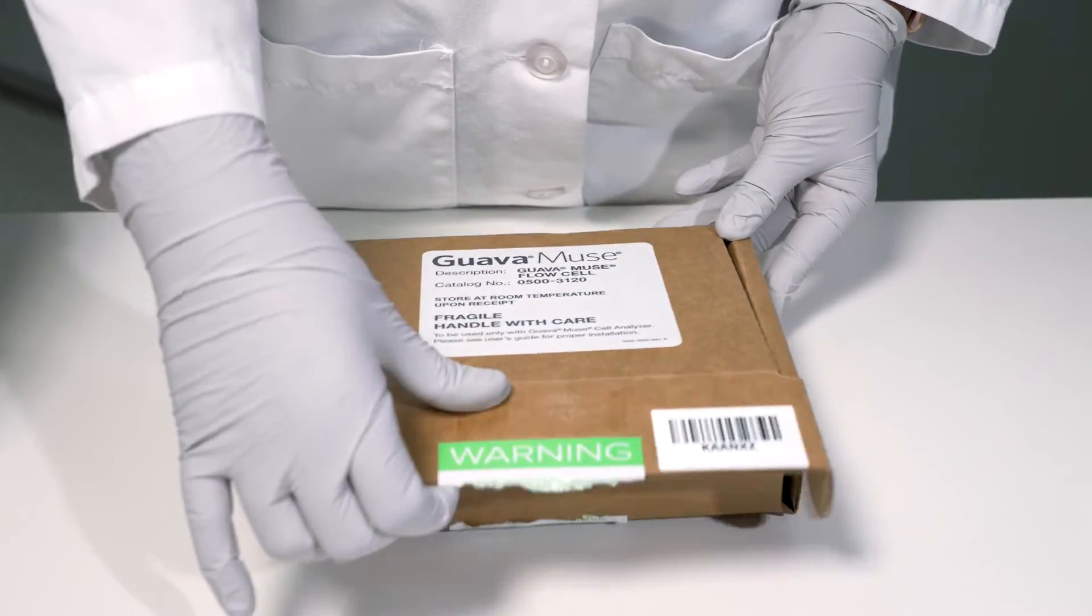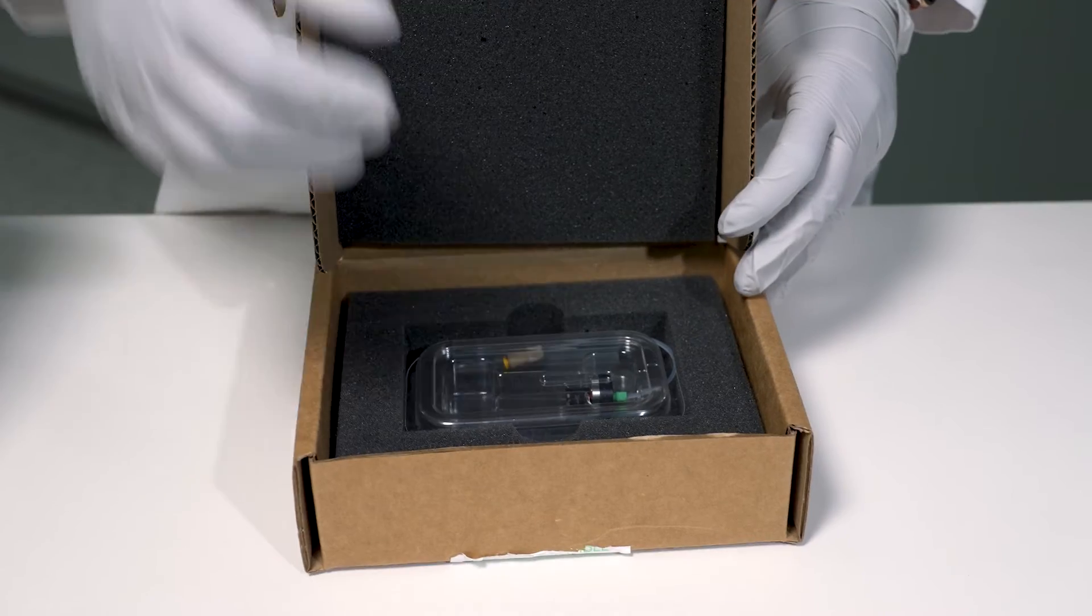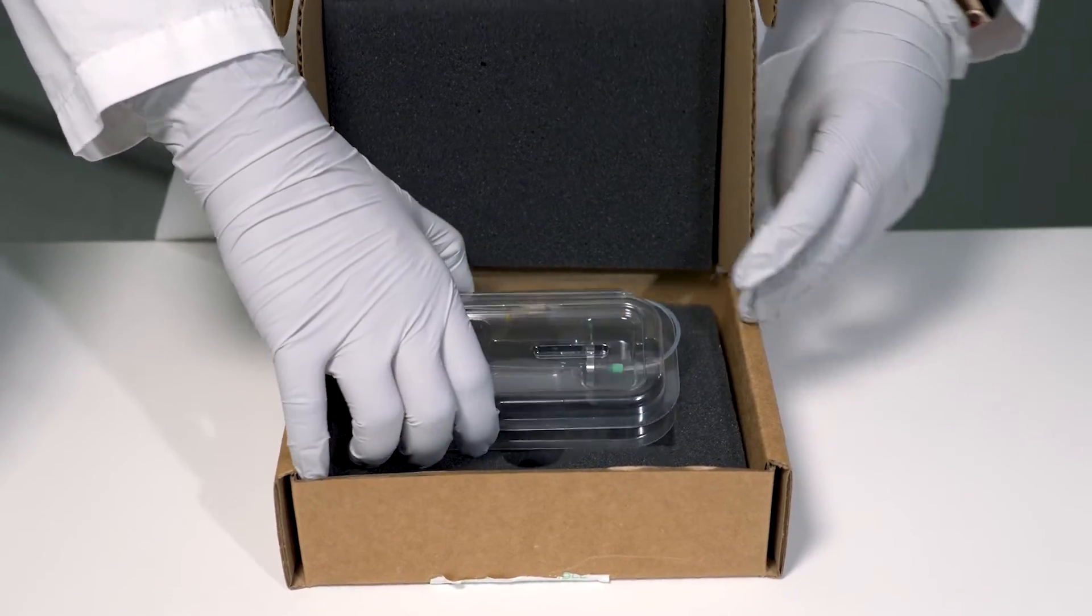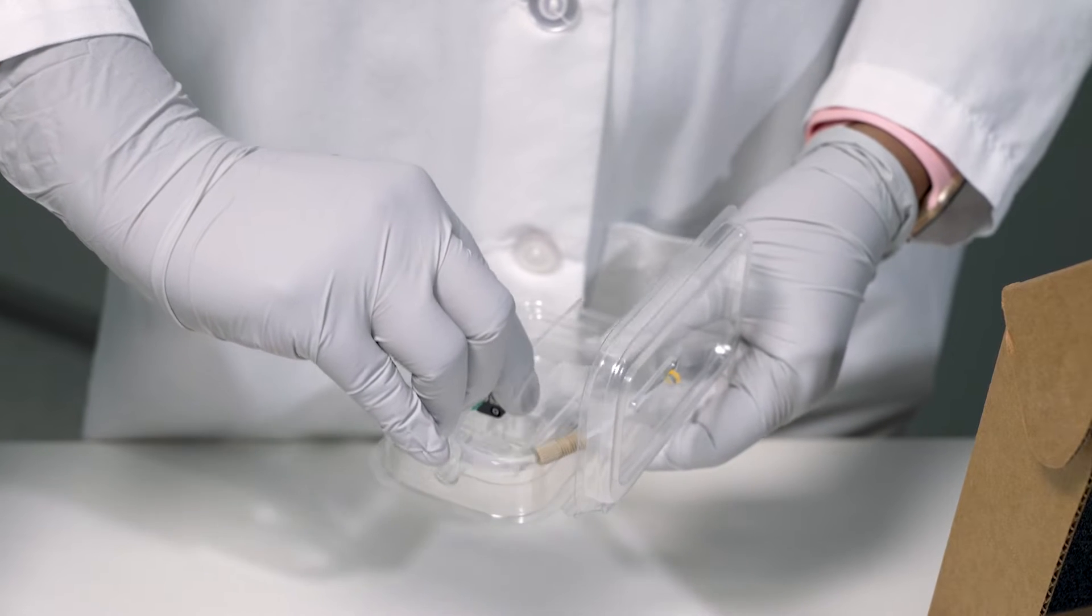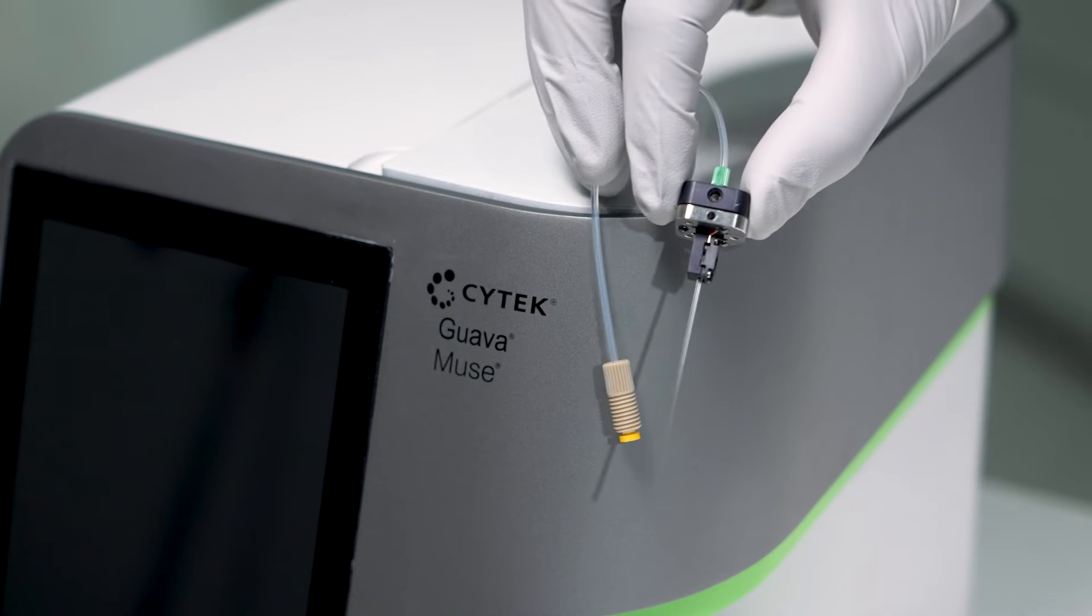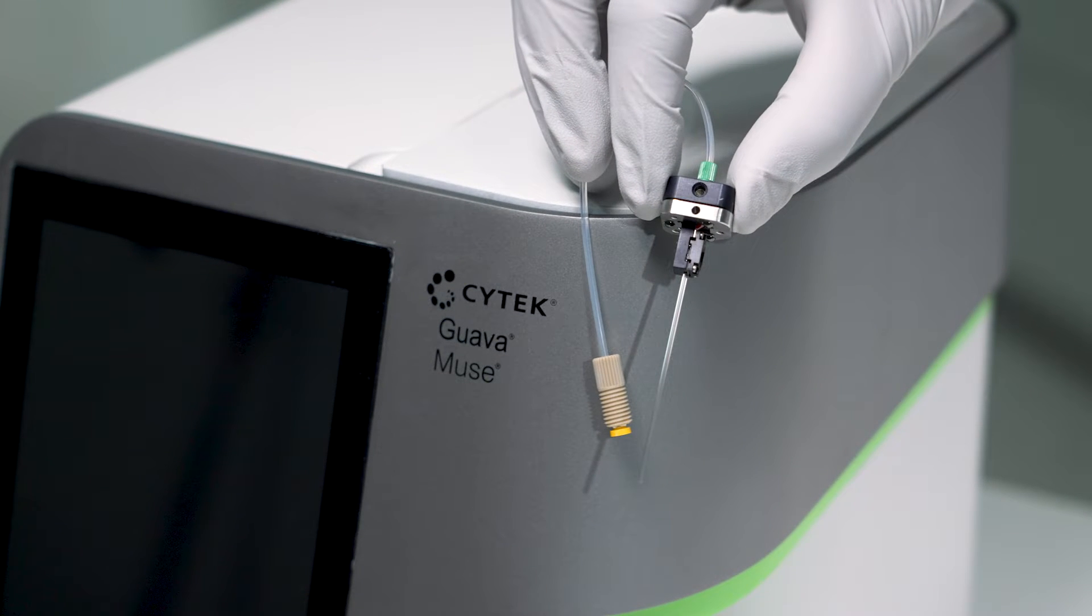Now it is time to install your flow cell. Remove the flow cell from the shipping box. Carefully remove the flow cell from its packaging. Holding as close to the green connector as possible, identify the glass capillary and lens area. It is important not to touch or allow fluid on the lens portion.